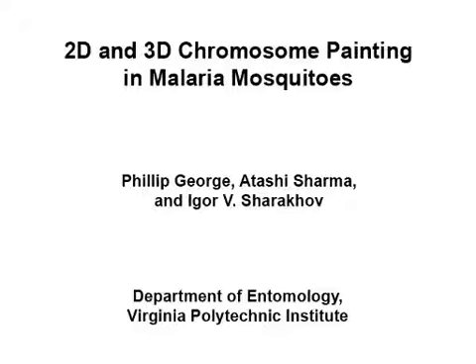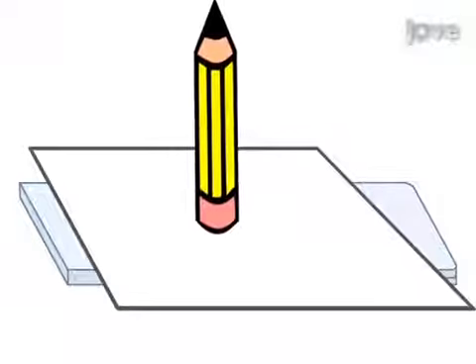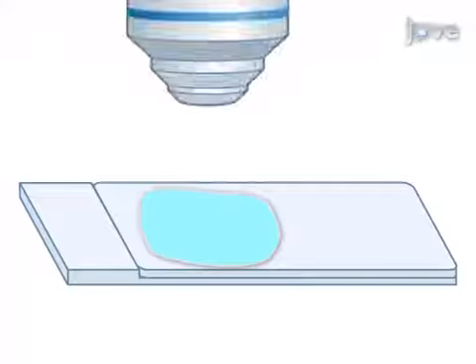The overall goal of this procedure is to produce sufficient DNA amplicon from a single microdissected polytene chromosome arm to use directly for FISH experiments.